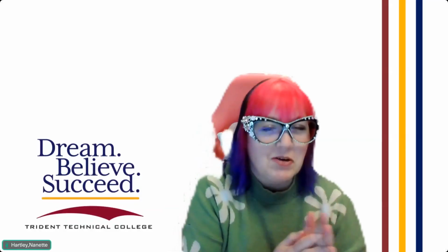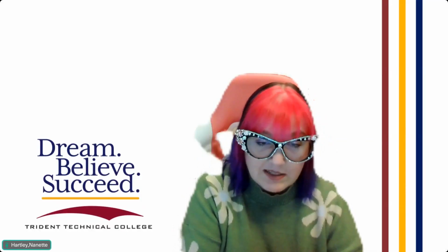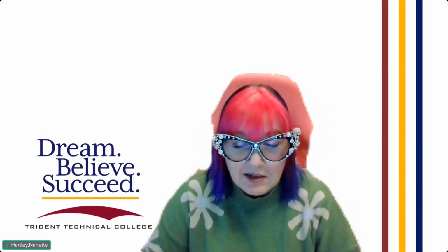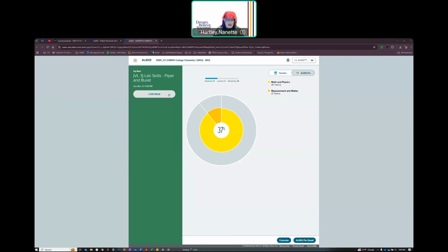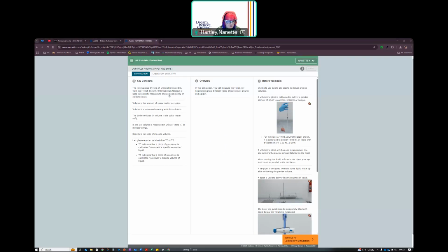Welcome back, guys. So we are taking a look at experiment 3, virtual lab 3, and this is about pipettes and burettes. Now, one thing that it talks about at the beginning of this, let me share my screen so that you are looking at the same thing that I am, is the difference between to contain and to deliver.